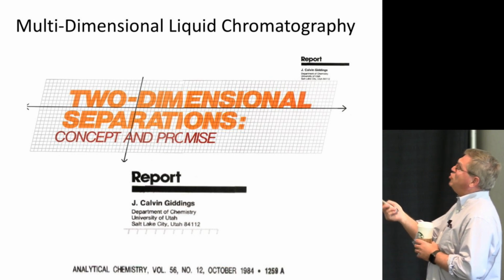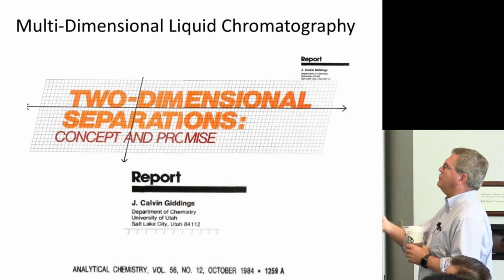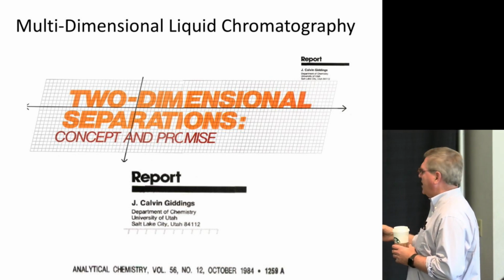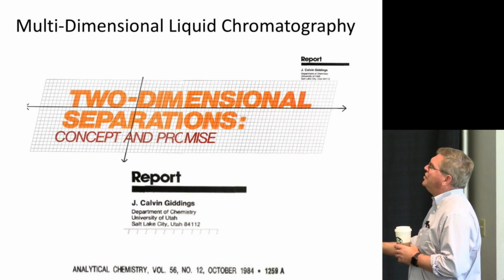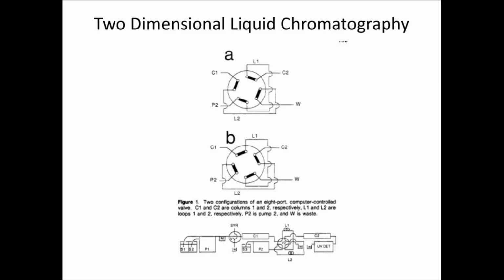People have been thinking about two-dimensional chromatography for a long time. I always thought this was the coolest idea for doing separations. And it was certainly important back when mass spectrometers didn't scan very fast, to be able to spread things out. And Jim Jorgensen's lab was also developing two-dimensional methods to do separations. He wasn't the only group, but he certainly had a major influence on me.